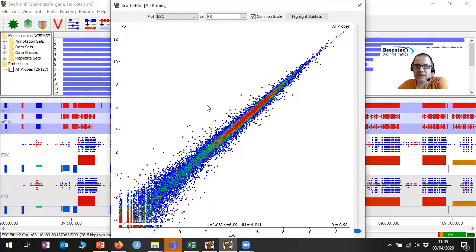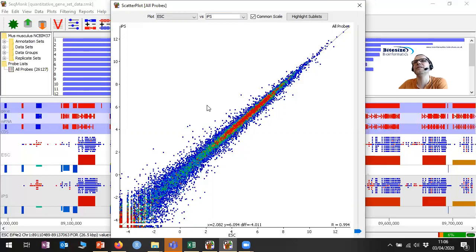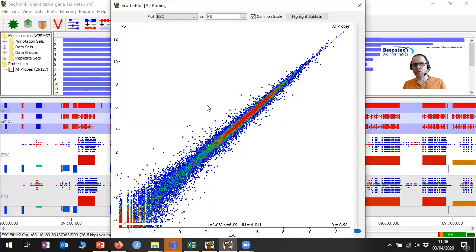Another way to approach this is by doing a quantitative enrichment. This turns the enrichment problem on its head. Instead of defining which genes are interesting and then looking for categories of predefined functional gene sets which might be enriched, you can directly test the sets of predefined functional genes and say: if I know that this set of genes is a connected set — binding genes, transcription-related genes, or whatever — I can test whether that set quantitatively does something unusual in my data. The advantage is that you're no longer relying on being able to identify a change in an individual gene.